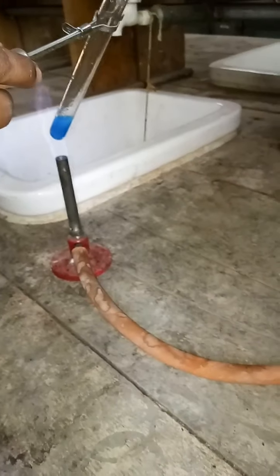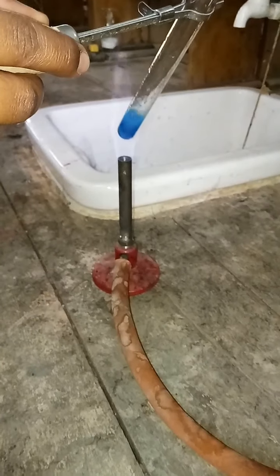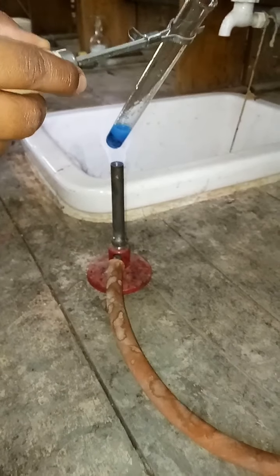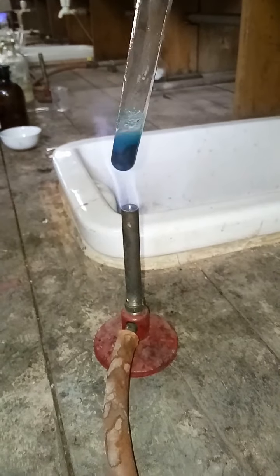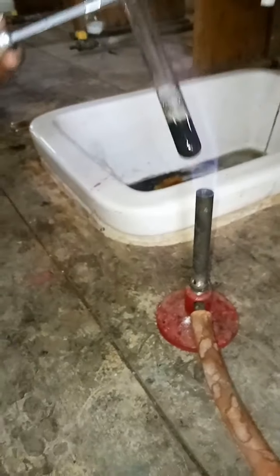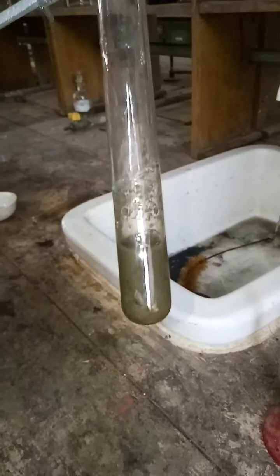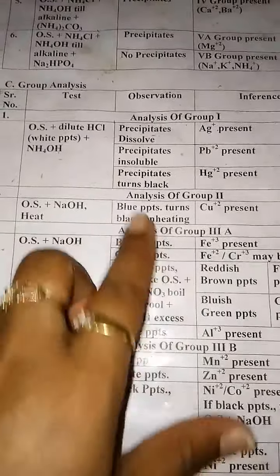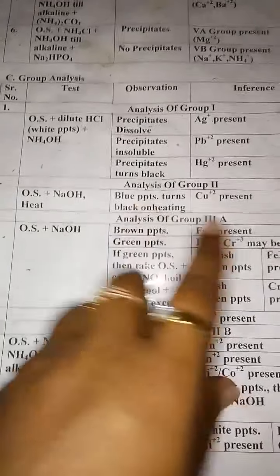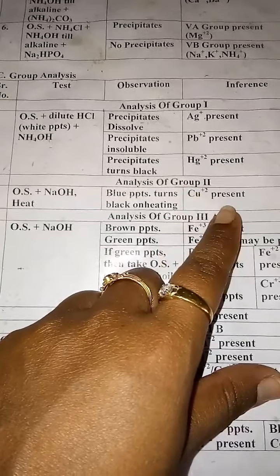The next test is OS plus dilute HCl plus H₂S. In the previous test tube with OS plus HCl, I will add H₂S, that is hydrogen sulfide. As you can see, we get black color precipitates, which means Group 2 is present. So in your observation write black precipitates and Group 2 is present. In my OS, either Cu²⁺, Cd²⁺, or Sn²⁺ may be present.